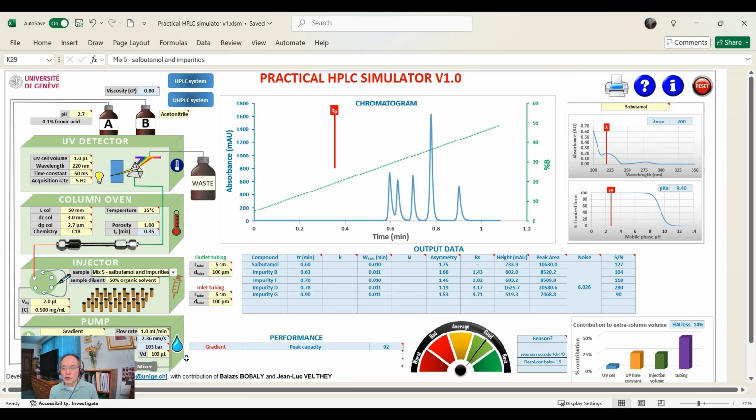Okay, so I think you get the drift of the software, and it's nice to get a real demo because there are some nuances which might be missed in a PowerPoint presentation. So on that note, we're going to go back to our video.